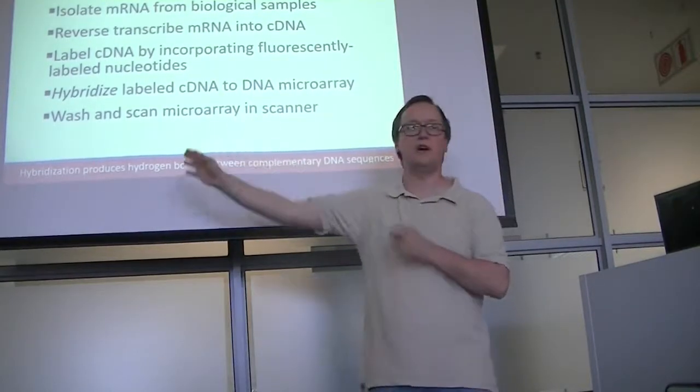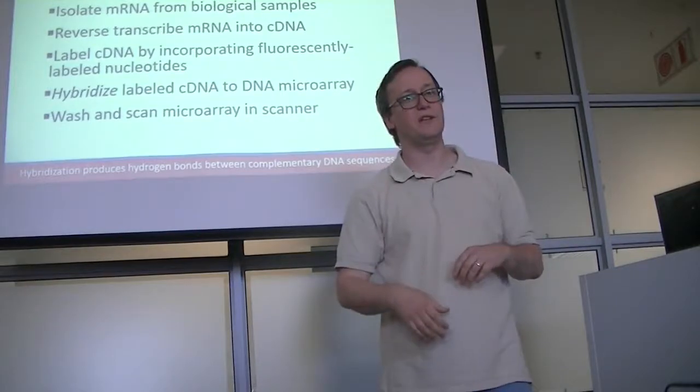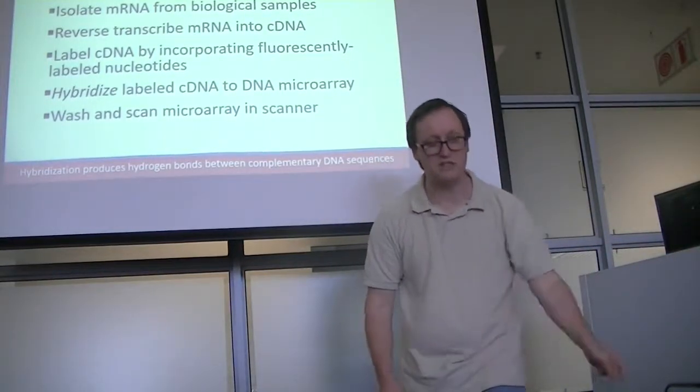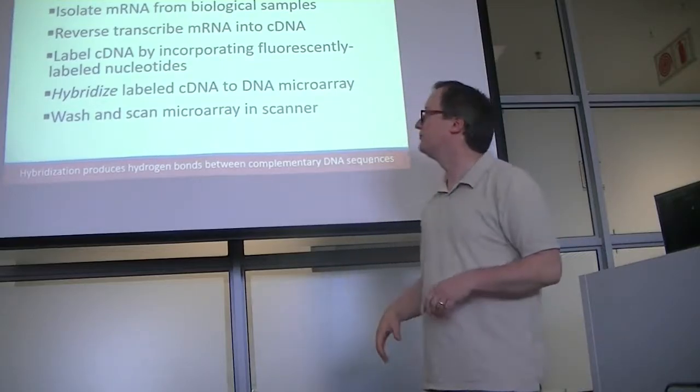And then we can wash off anything that's non-specifically bound and actually measure it by putting the appropriate light source across it and measuring the intensity that comes out.